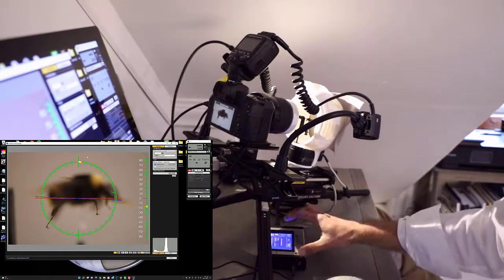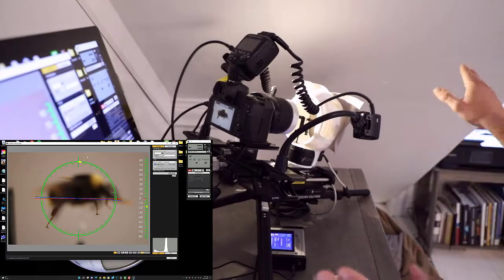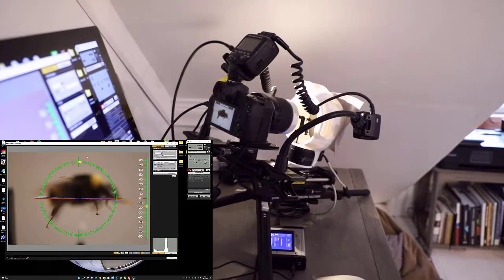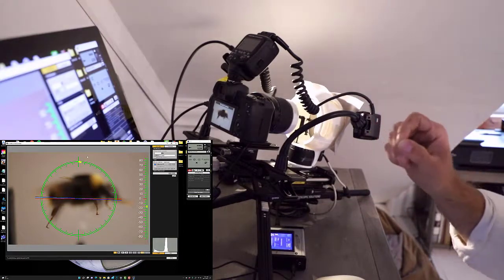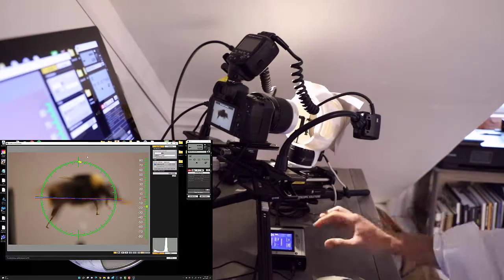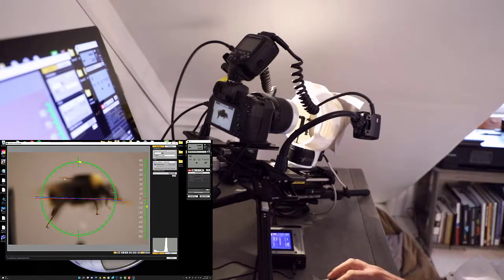And I want to emphasize that on this particular specimen, we have one of the wings that's open wide and another one that's actually closed and runs along past the thorax and abdomen of the specimen. So I rotated the specimen to get the side where the wing is not sticking out because we want less depth. We also don't want to go all the way to the back of the wing. It's so oblique that you're not going to reveal any information anyway. So why go all the way to the very back when you don't need to? So you can see where my focal plane is here. I'm about halfway down that wing.